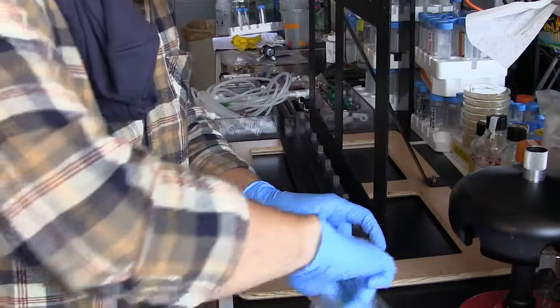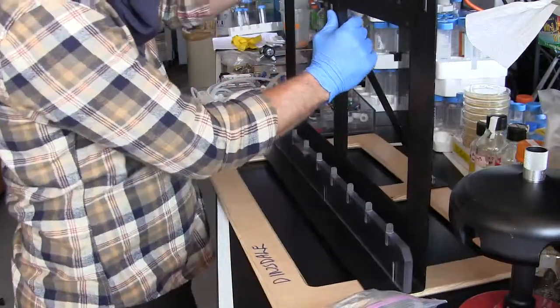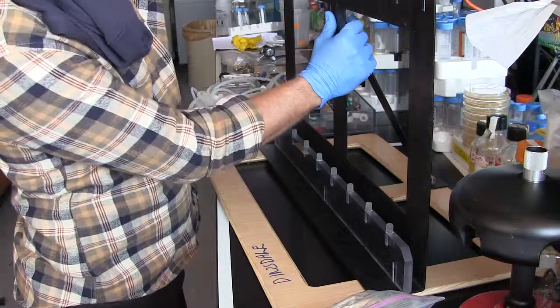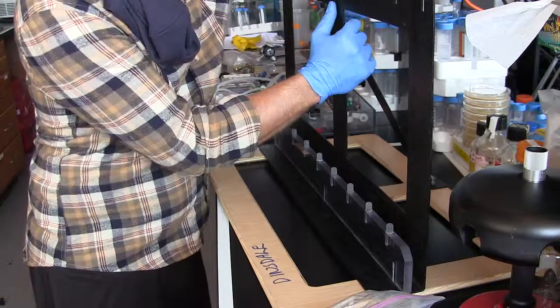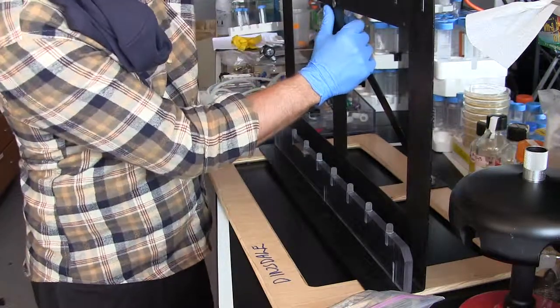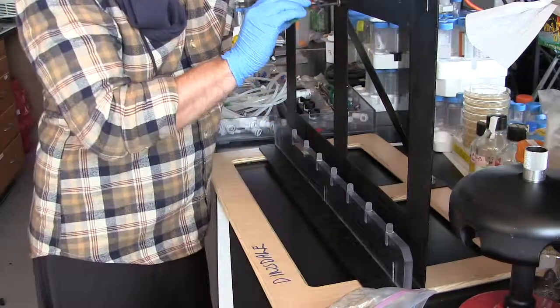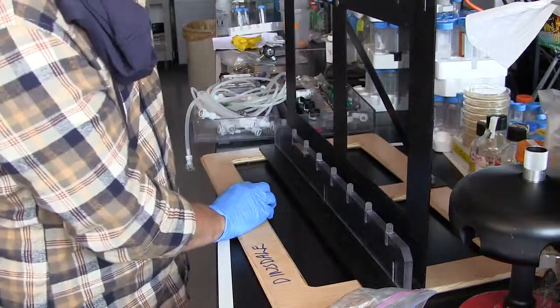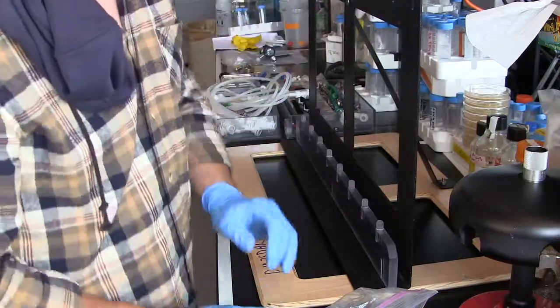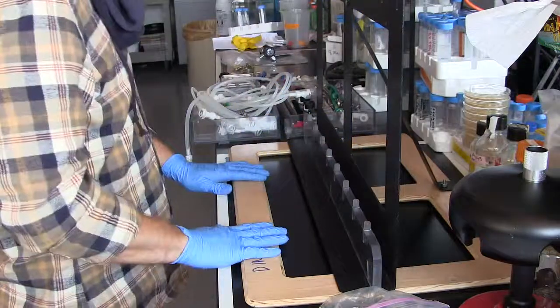You stand it up, put another bolt through the slot in the center of the back plate here. Like so. Hang on, let's tighten it up. There we go. So now you see that's very, very stable. Okay. Next.